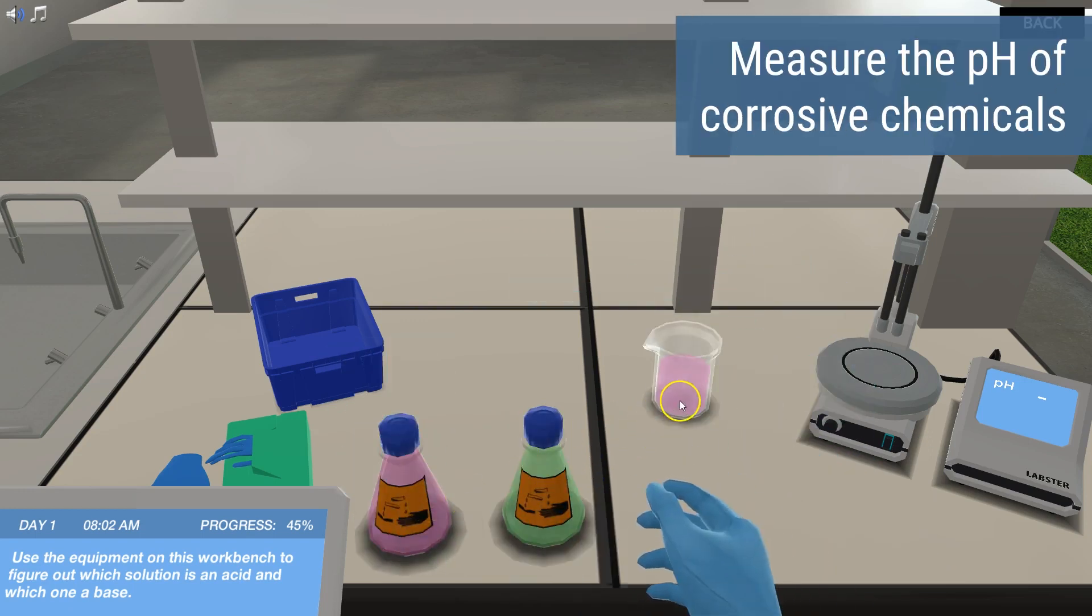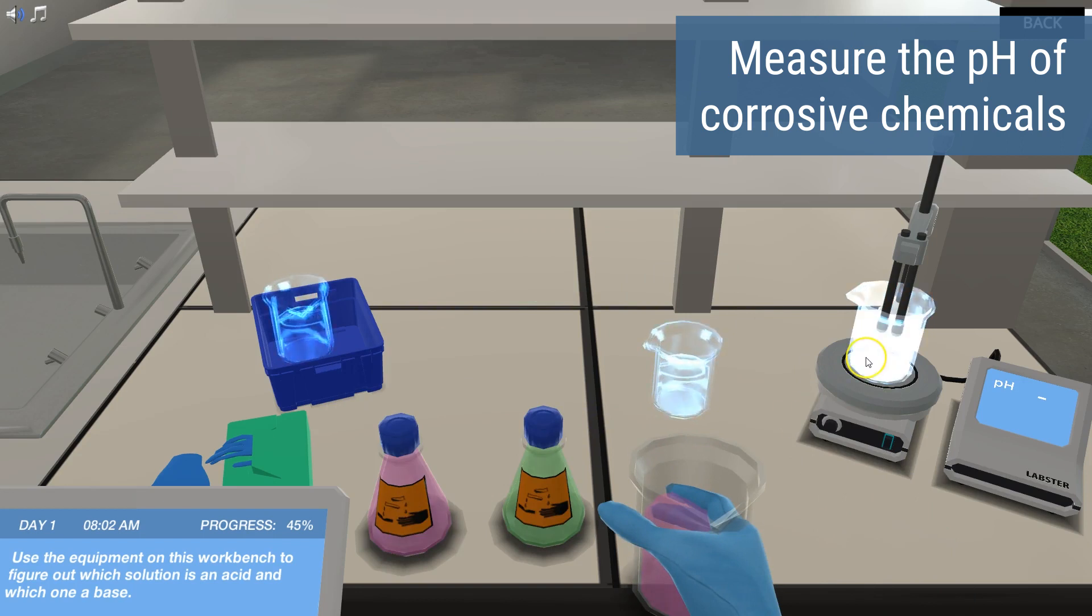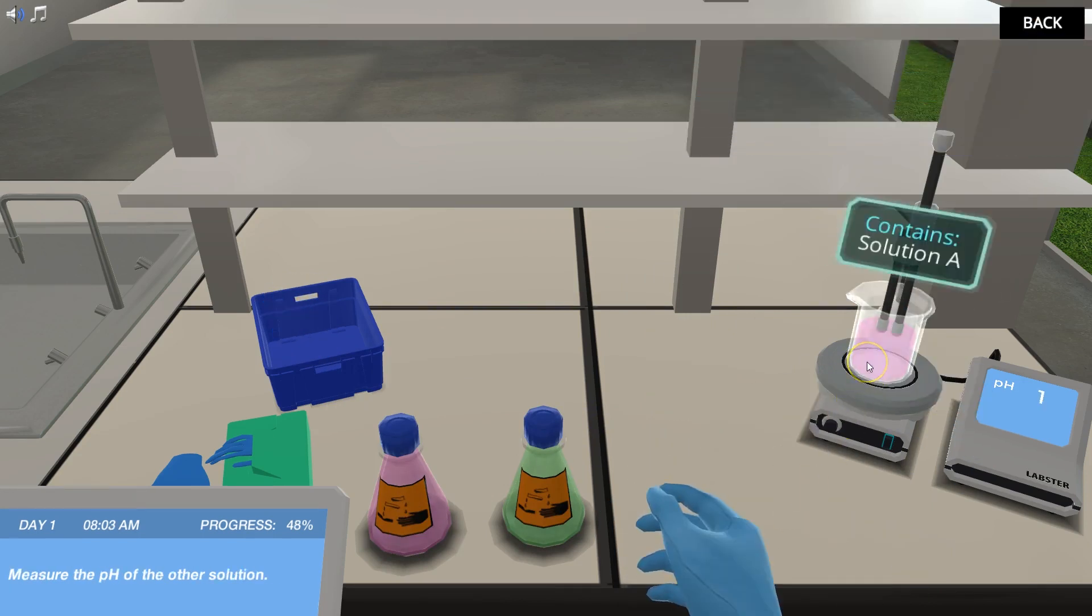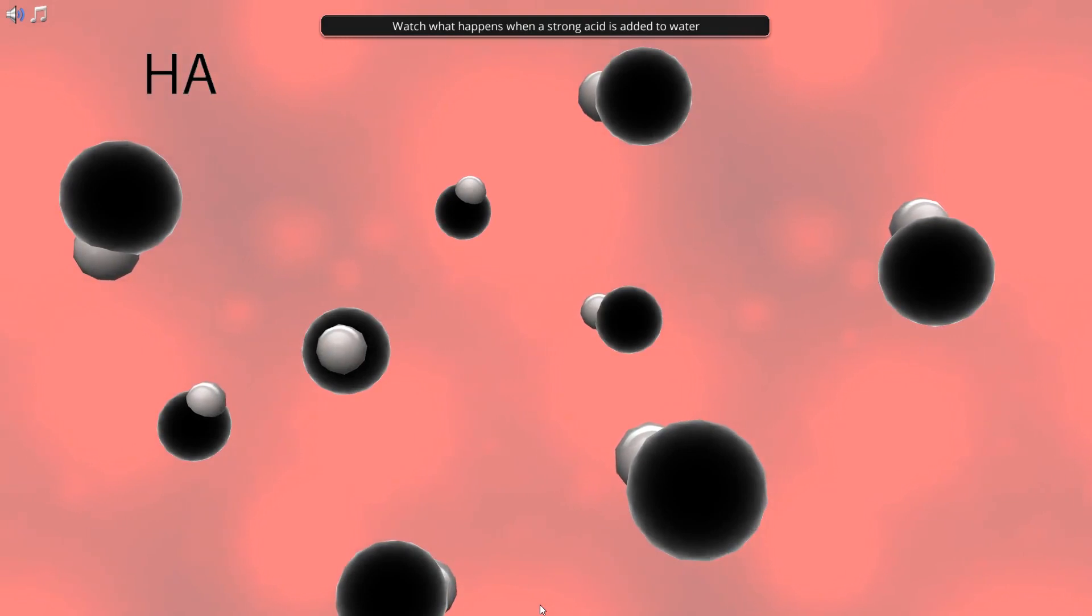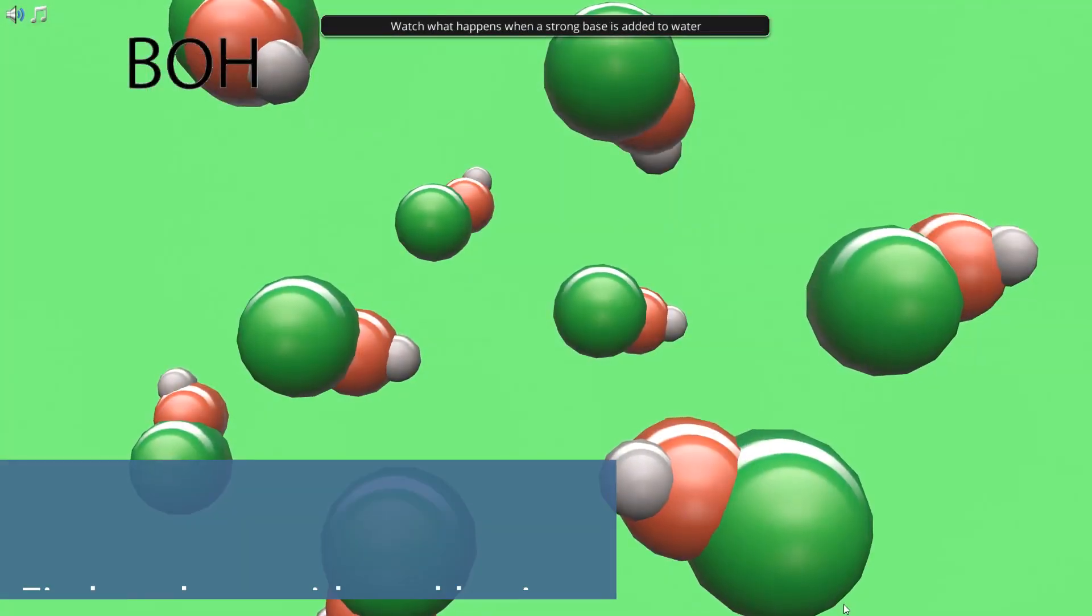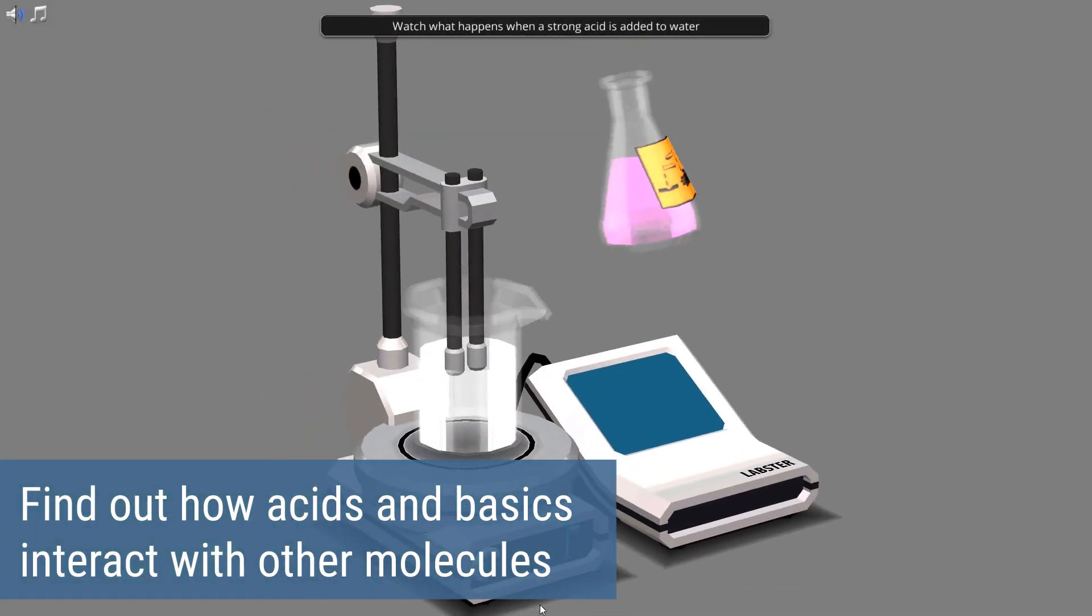Grab a pH meter to measure the pH of strong corrosive chemicals and identify the mysterious solutions. Learn the difference between strong acids and bases and find out how they interact with other molecules.